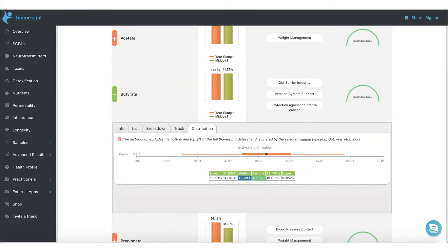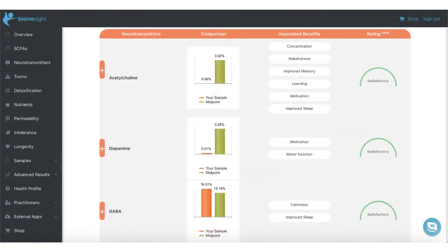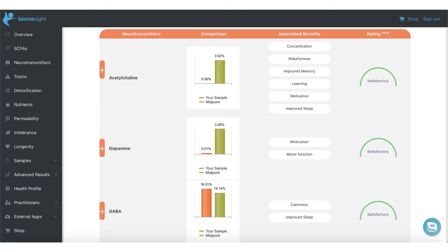We also show the distribution for individual bacteria as well as end products. The same goes for our neurotransmitters section, where we cover key neurotransmitters like GABA, dopamine, serotonin, acetylcholine, histamine, and norepinephrine.